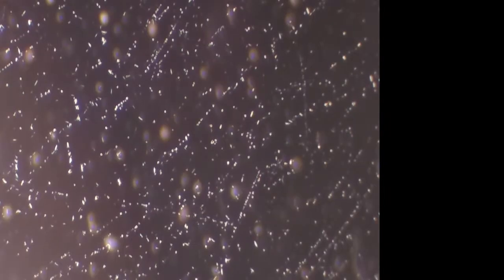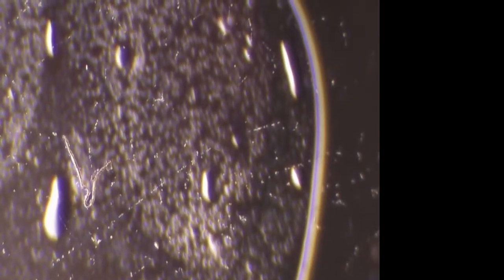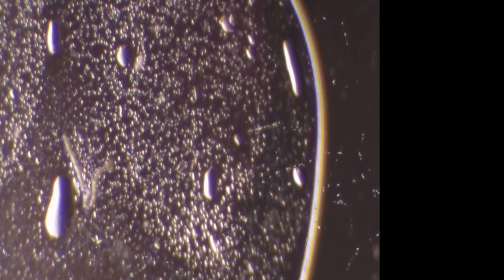This kind of dark field or oblique lighting is great for little tiny dancing things against the background. Nothing. That looks like a cell right there, even as a giant air bubble with some stuff in it.